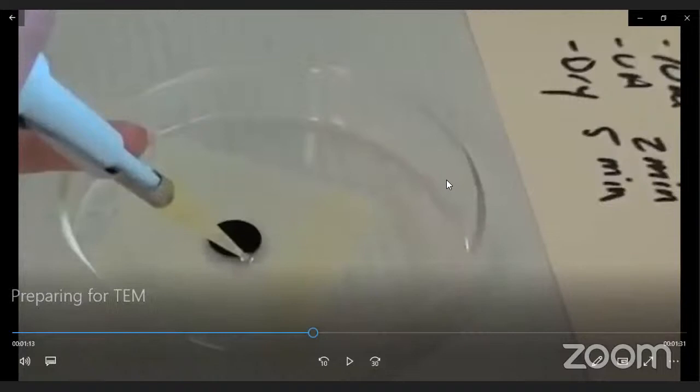Now this sample needs to be placed in the TEM. We are just soaking the excess ethanol or water, and so this sample is now placed securely. So this is the basic process of sample preparation.